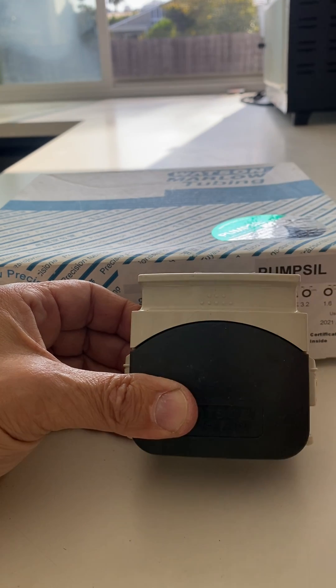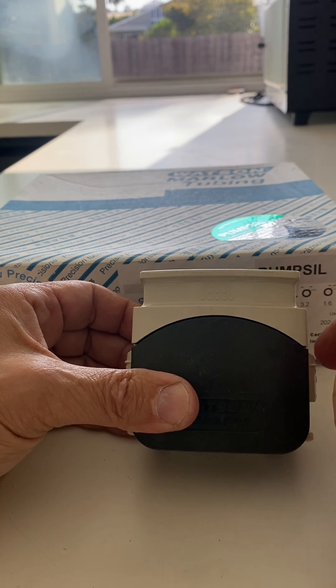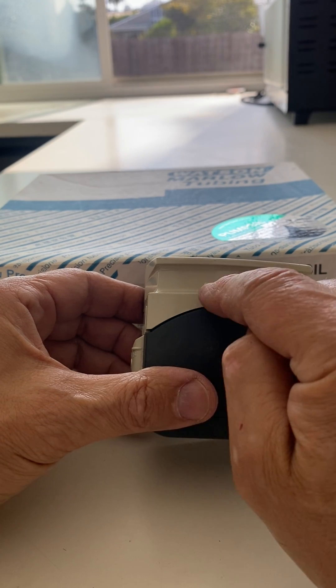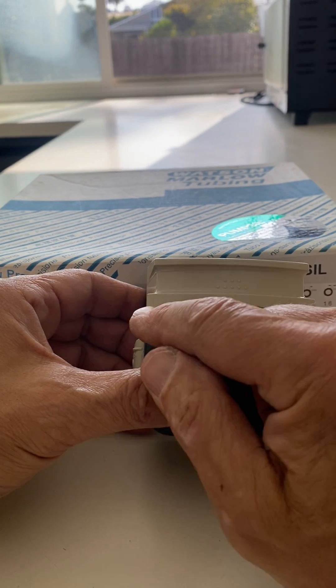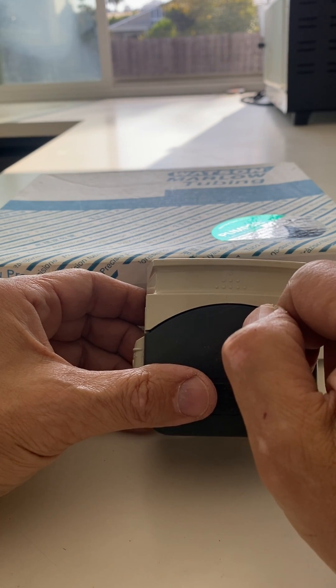Once it's adjusted, you are ready to run. The adjustment is to prevent the tubing from walking through the head if the adjustment is too loose, or from bunching up inside the head if the adjustment is too tight.